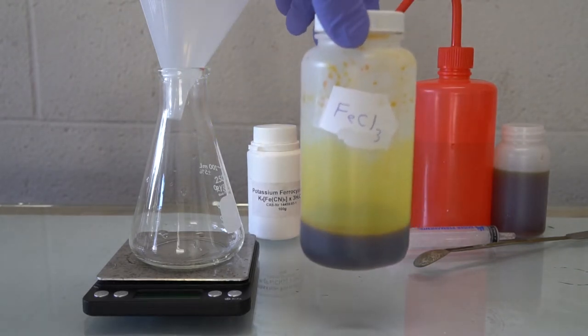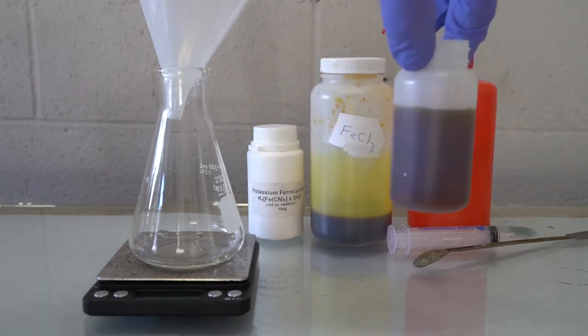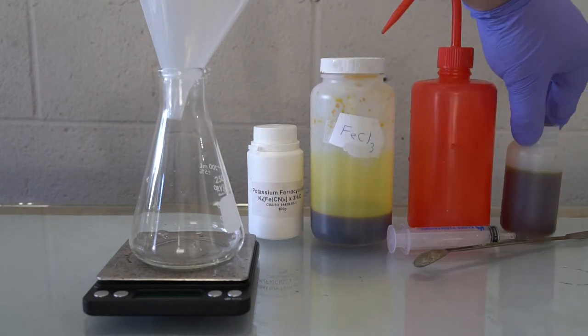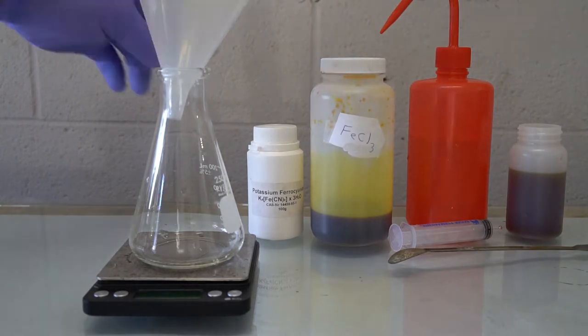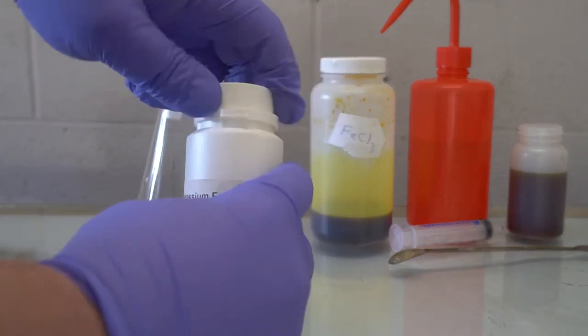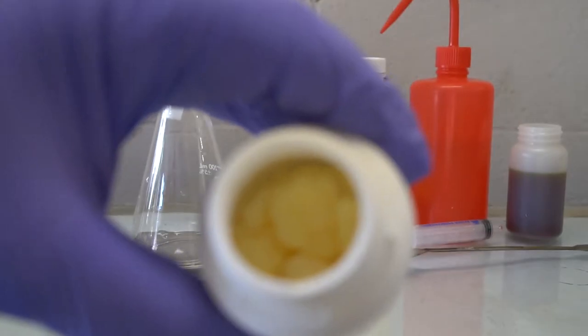We measured out five grams of potassium ferrocyanide into a 250 milliliter flask and added 175 milliliters of distilled water. We gave it a good stirring with our trusty iron spoon.